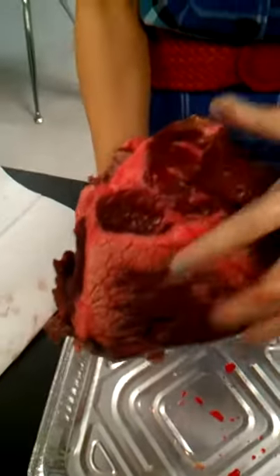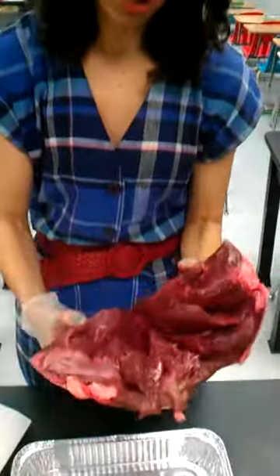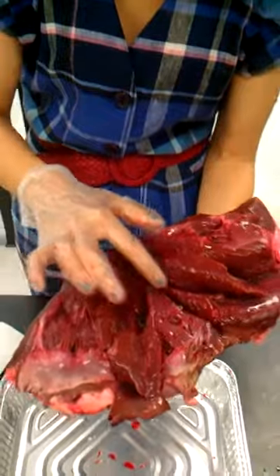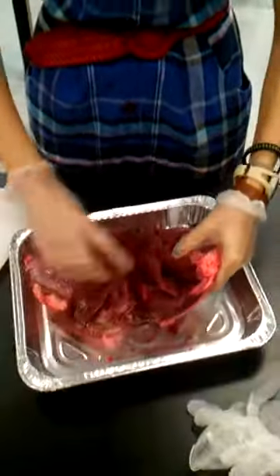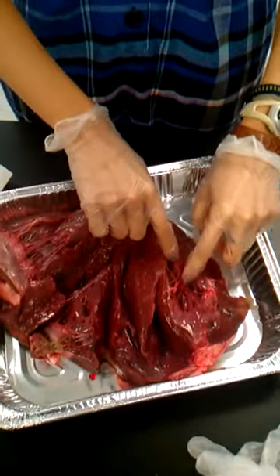There's also the bright red tissue, and if you look inside of the heart, this heart has been cut open. So here's when the heart's closed, it's like this. And then when you open up the heart, you see there's all these different compartments, and a lot of these little tubes and sections where the blood can go in and be pumped out. So for example, you look here, this looks like a giant blood vessel.